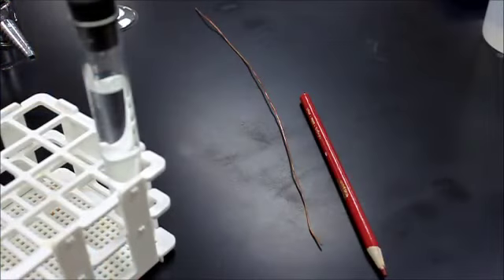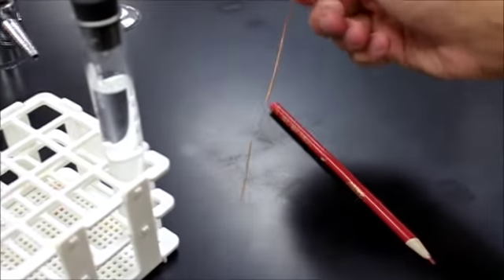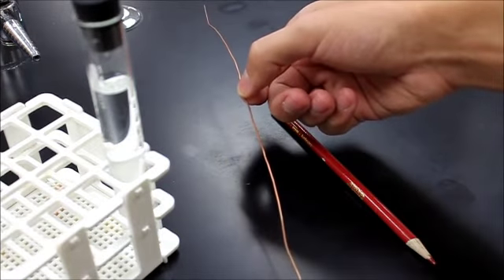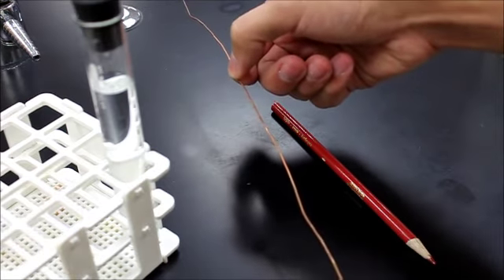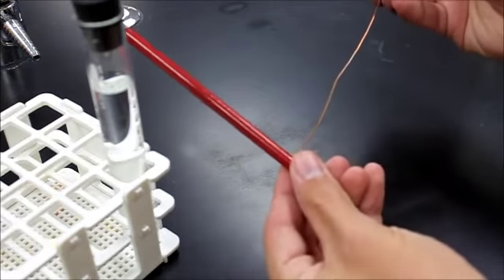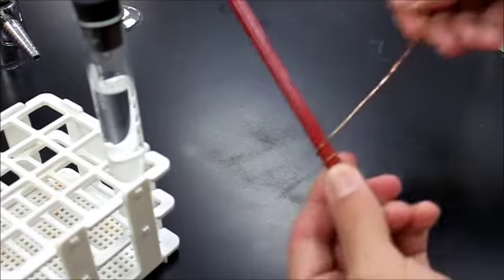One of the first parts of the procedure is going to ask you to take the copper wire and put it into your test tube of the silver nitrate. However, our wire is far longer than our test tube of silver nitrate is. We want to get as much of it into that silver nitrate as we can. So what we're going to do is we're going to coil it. So you need some other type of writing utensil, and what you're going to do is you're going to pin it here, and you're going to wrap this around into a coil.